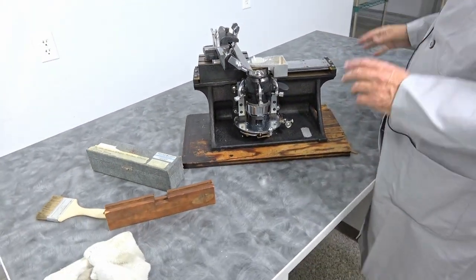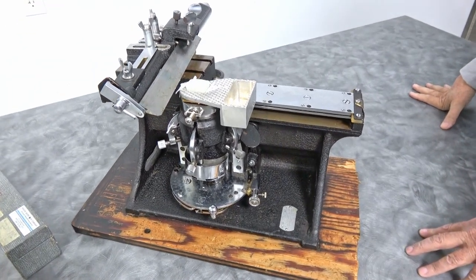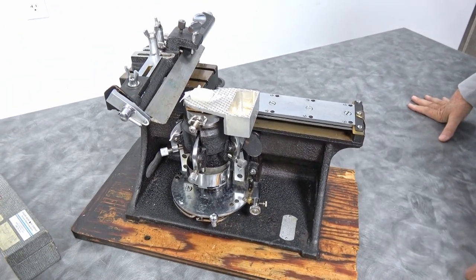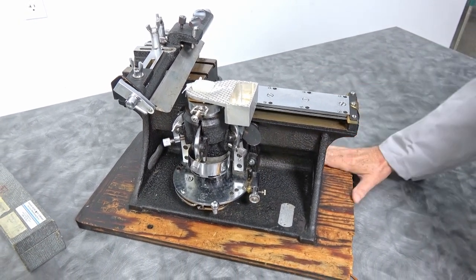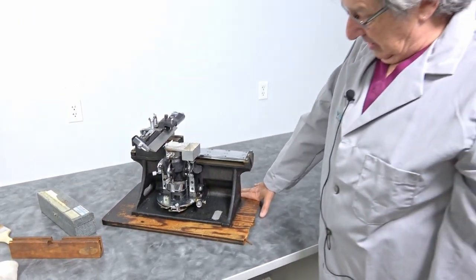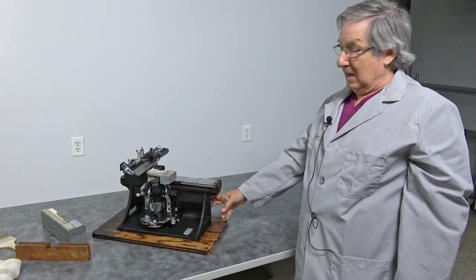Nice little unit, it will make a nice museum piece as well as an actual working microtome. So if you're interested in the history of the sliding microtome, there's one to take a look at.